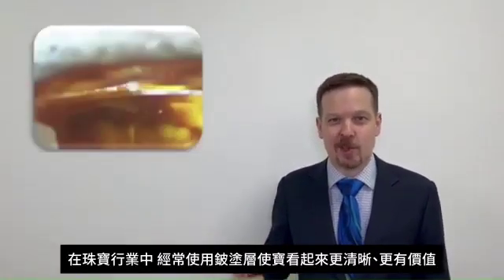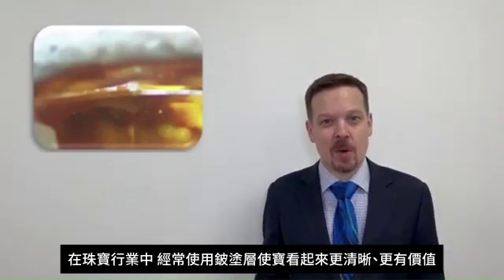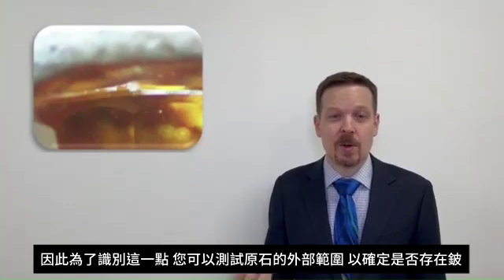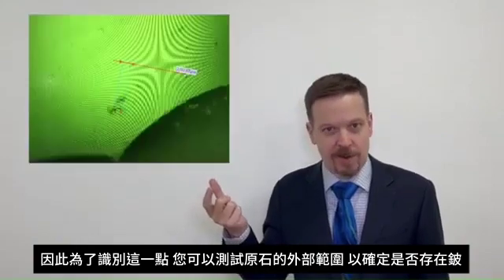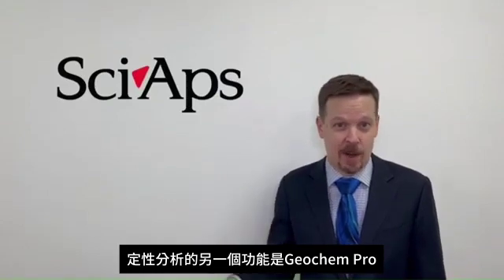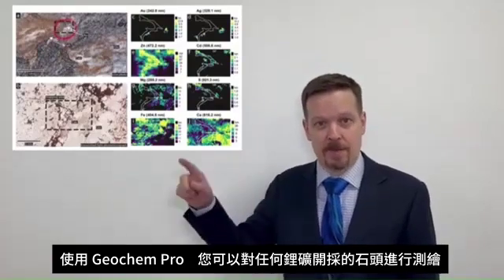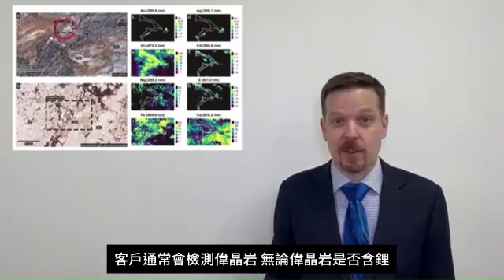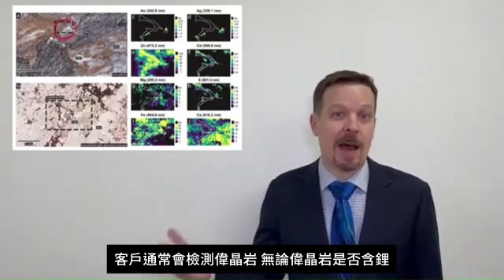on the sample. In the jewelry industry, they'll often use beryllium coating to make the stone look more clear and more valuable. So in order to identify this, you can test the outer reaches of the stone to identify whether or not there's beryllium. Another aspect of the qualitative analysis is using Geochem Pro. And in Geochem Pro, you can do mapping of the surface of any stone. With lithium mining, they'll often look at pegmatite, whether or not the pegmatite is lithium bearing or not lithium bearing.